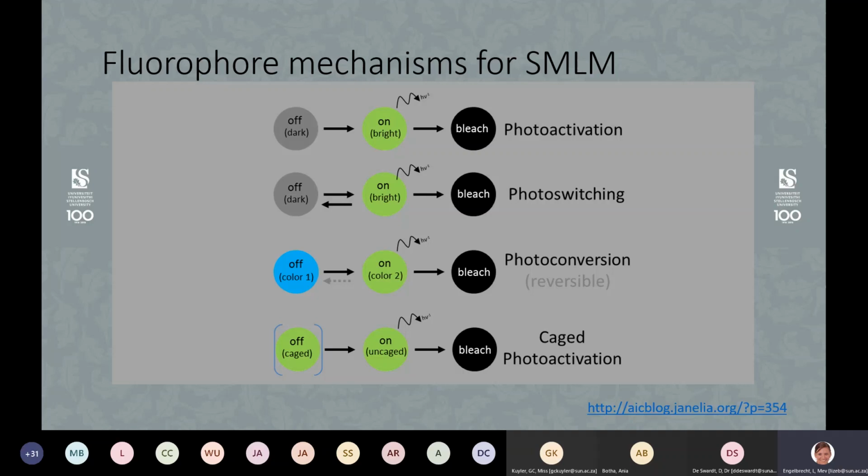But then when you put UV light on, it changes to a different color. And that change is only in some of the fluorochromes at a time. So you would start off with, say, for example, a green dye, the whole image would be green. And then if you switch to the red part where you have UV activation, only some of them will change to red. And you can image the red in the PALM STORM feature, eventually switching all of them from green to red. And you would then have a super resolved image in red.